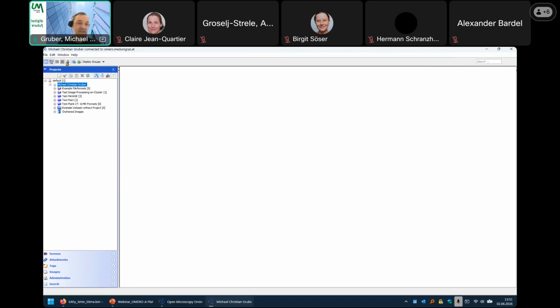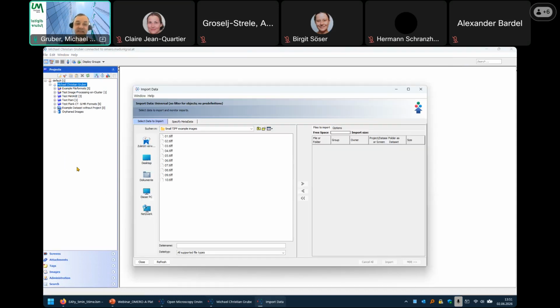I can then just say upload new images. It opens up then with the view of my local directory, and I can select here some example images, which are small TIFFs.